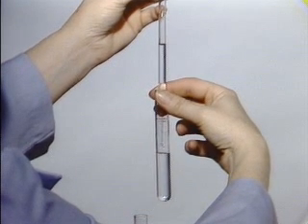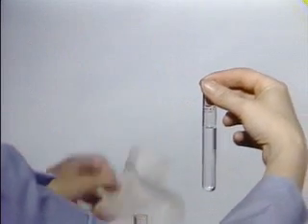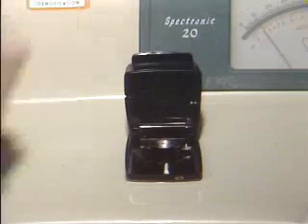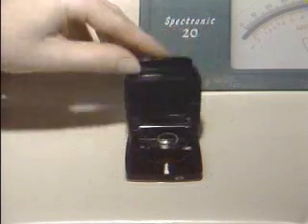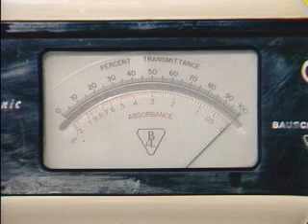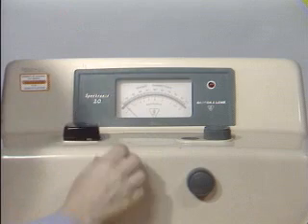the unknown species. The glass sample tube, called the cuvette, is filled with the blank solution, wiped with a soft, dry, lint-free tissue, and inserted into the spectrophotometer with the marks on the tube and the spectrophotometer aligned. The control knobs are adjusted to set the meter to read 100% transmittance or zero absorbance when the light beam passes through the blank solution, and zero transmittance or infinite absorbance when there is no light passing through the solution.